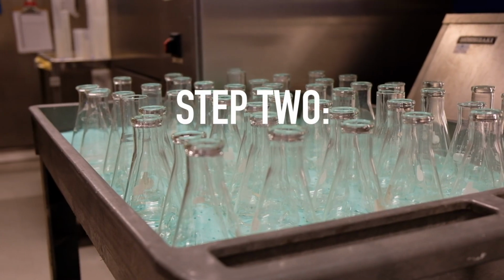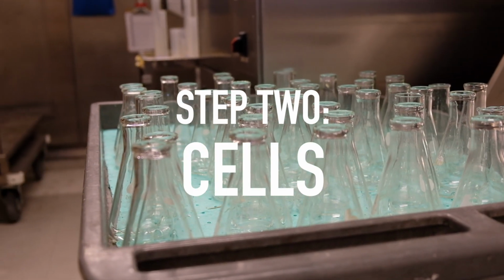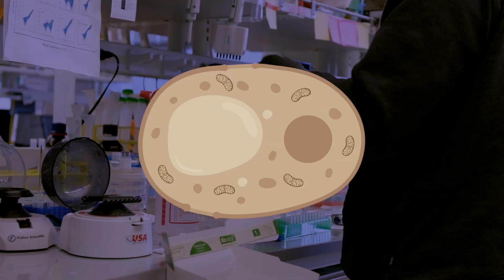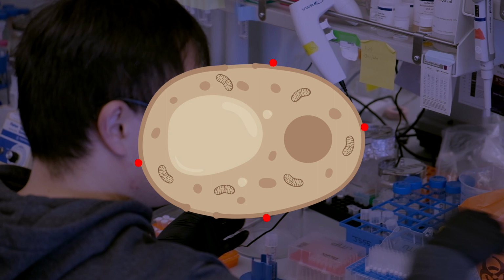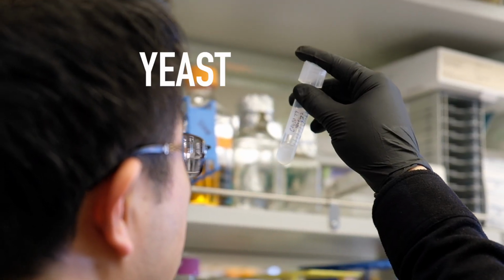Once we've acquired the DNA that encodes the new proteins, we need to put it into cells so that they can carry out those genetic instructions. In these experiments, we grow yeast cells. Laboratory yeast are great at making proteins. In this case, we've genetically engineered each yeast cell to not only make one specific designer protein, but to also decorate the outside of the cell with many copies of that protein. This is called yeast display.